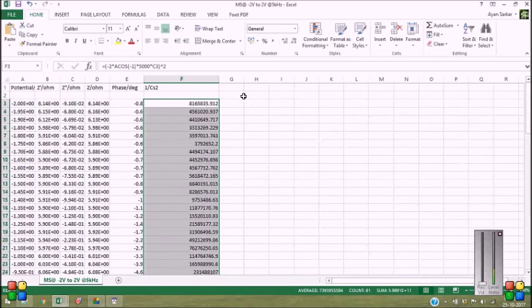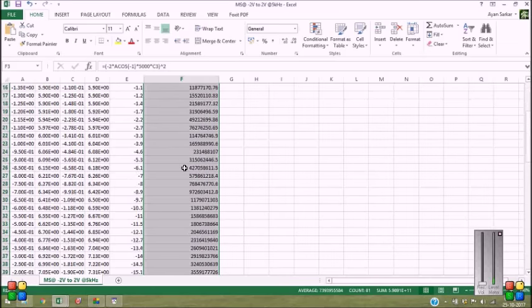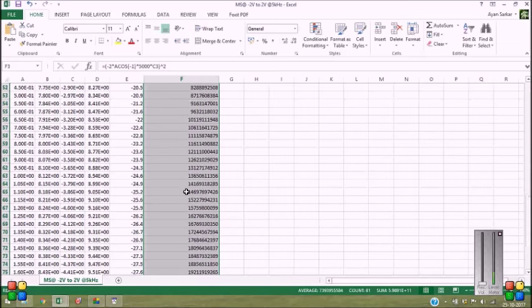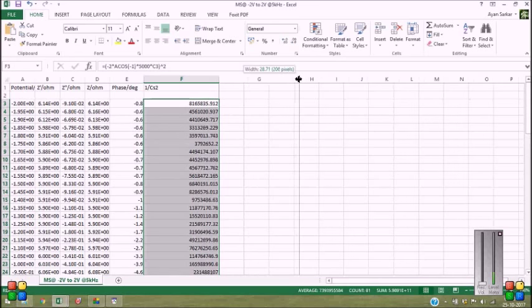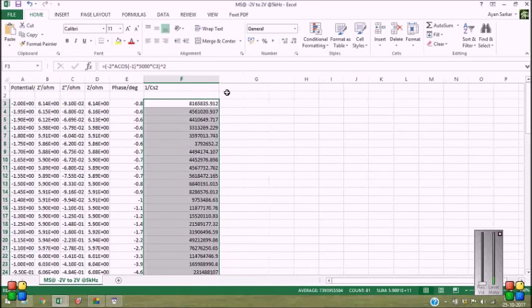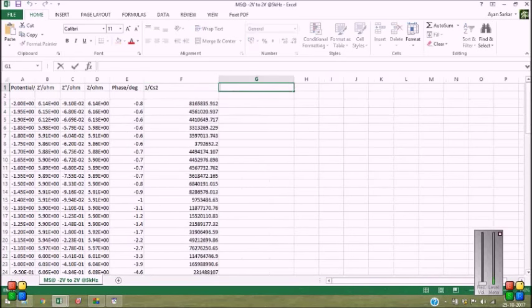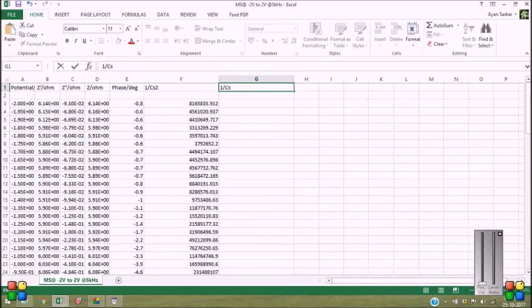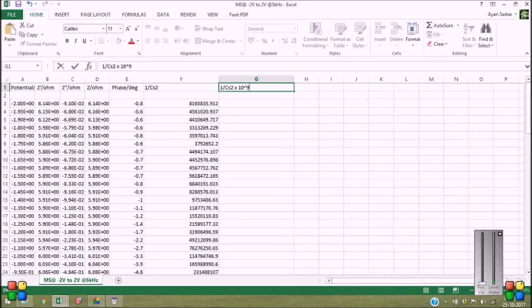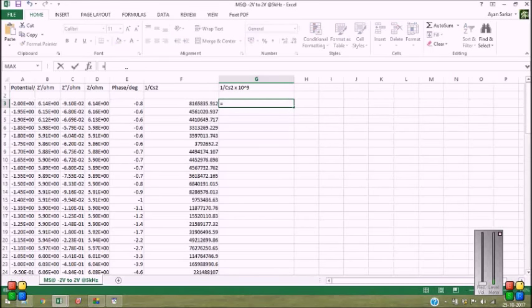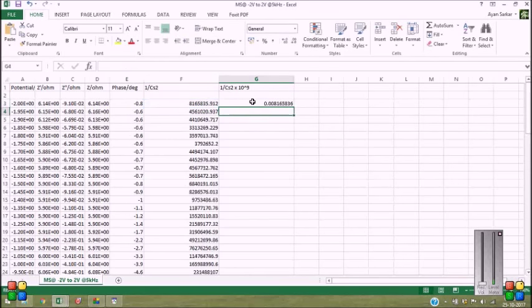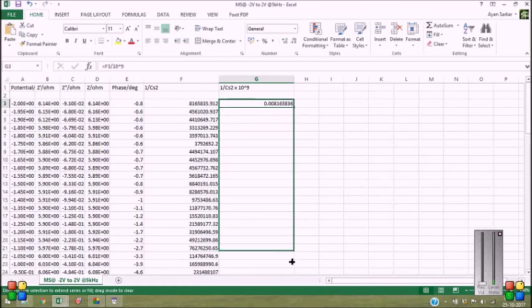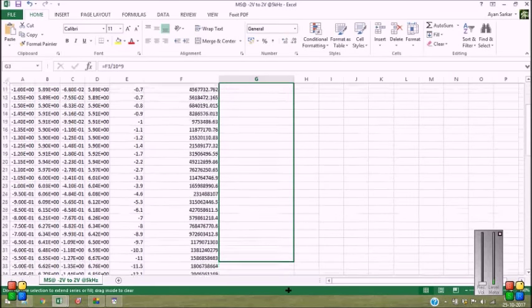Now you can see these are quite large values. So let me divide column F with 10 to the power 9. It will be suitable actually. So 1 by Cs square times 10 to the power 9. So it will be F3 divided by 10 to the power 9. Fine. And let's do it for the rest of the values.